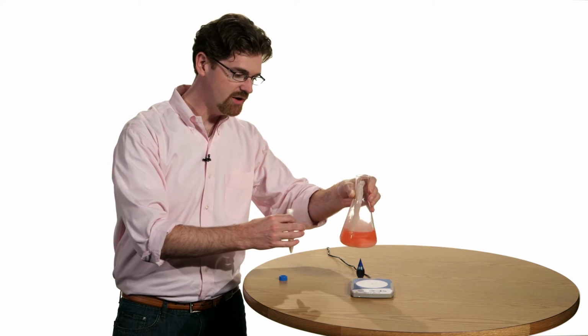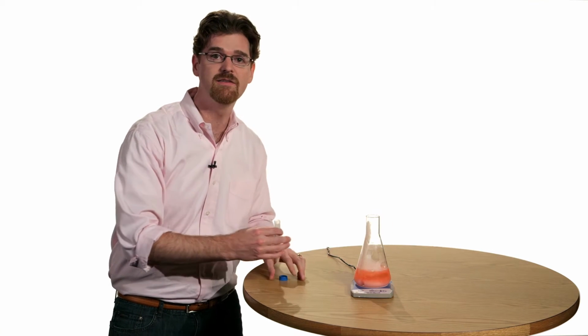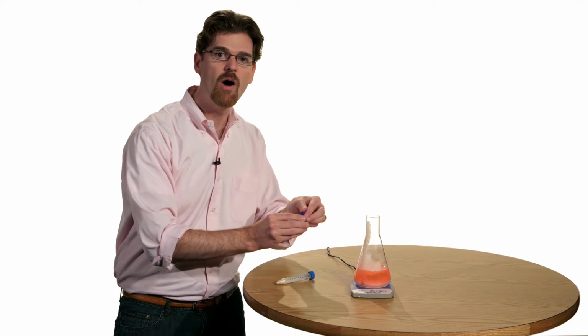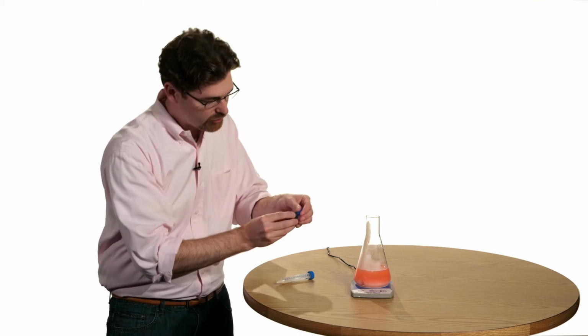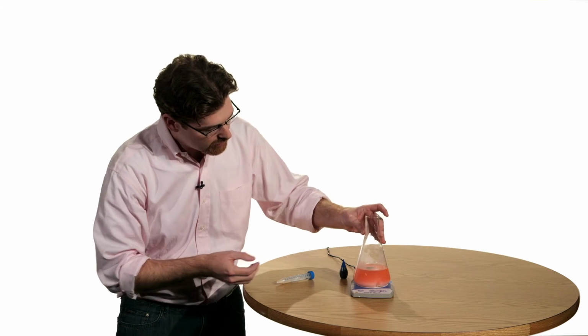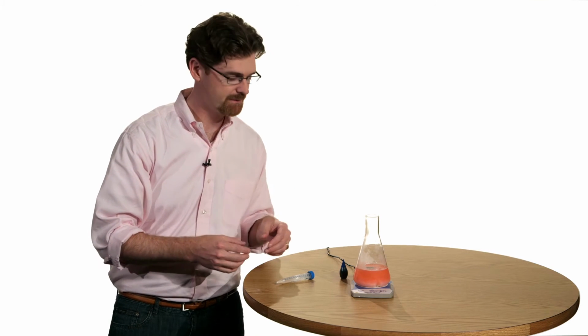The consumption of nutrients here is not even, and it leads to a diffusion-mediated gradient inside the container. Similarly, oxygen diffusing from the atmosphere or the headspace of the reactor will not be transferred efficiently through the system. As a result, the cells won't have access to the nutrients that they need to make our protein.